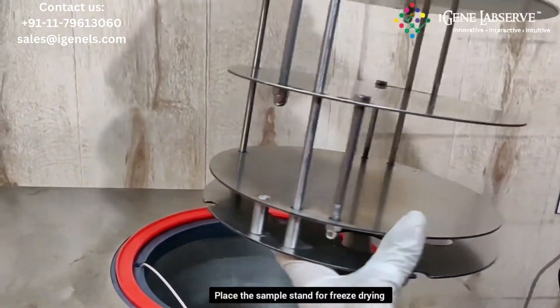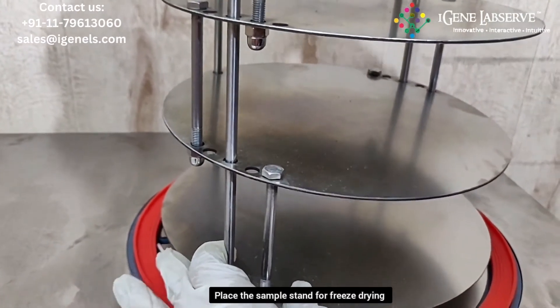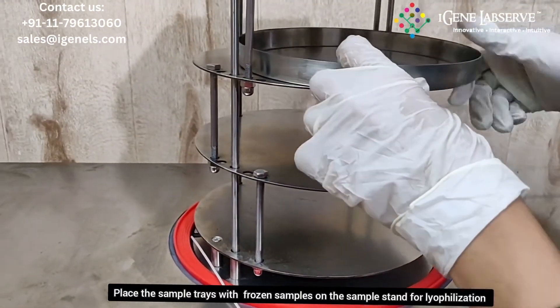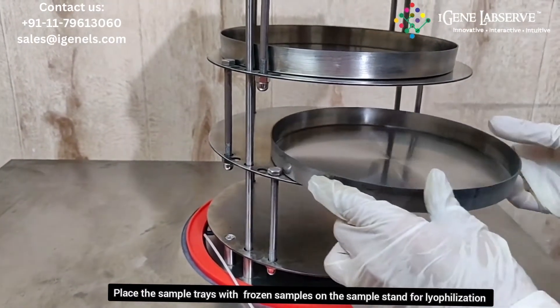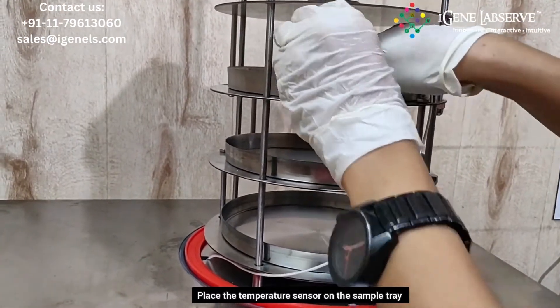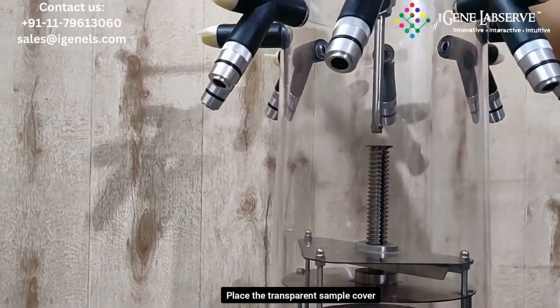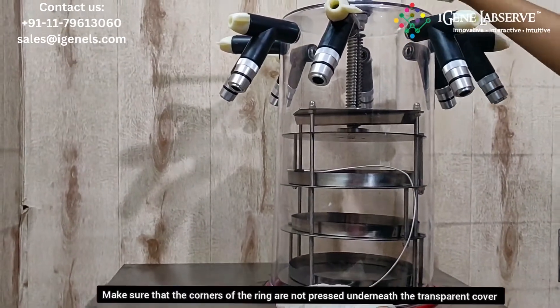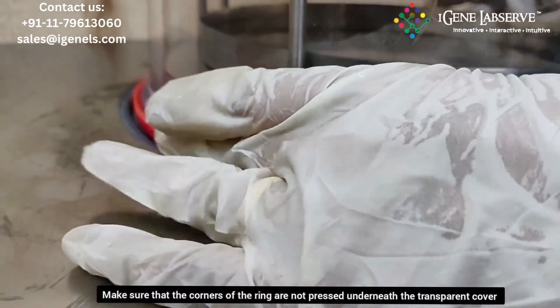Place this for the freeze drying in here like this. You can place the samples over here — the frozen samples — for lyophilization. Then place this temperature sensor on the top shelf right here near the samples. And then place this cover on top like this. Make sure that the corners of the rings are not pressed underneath this cover.